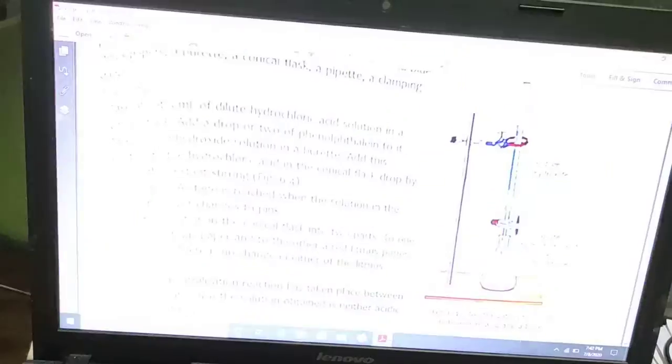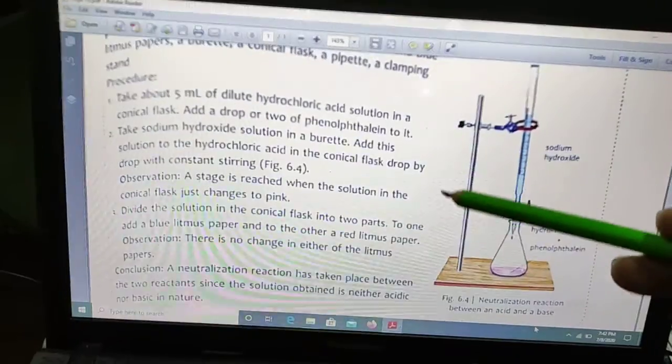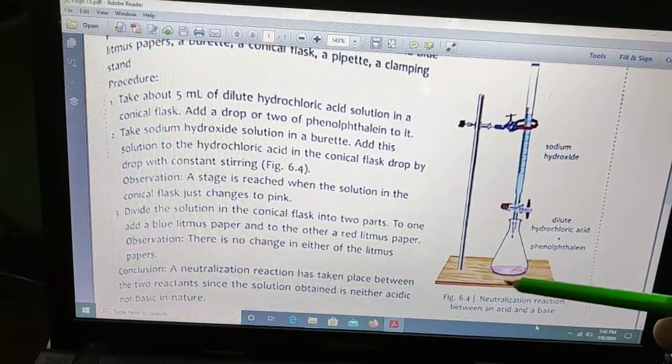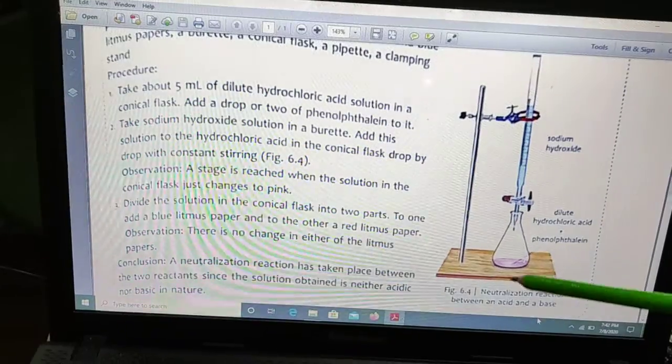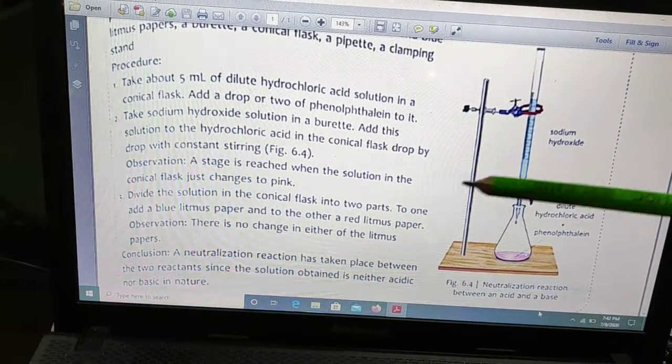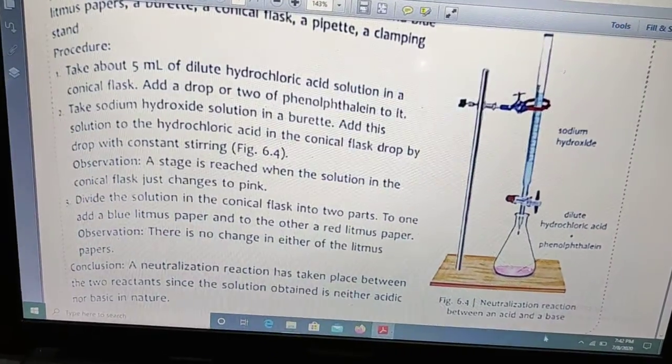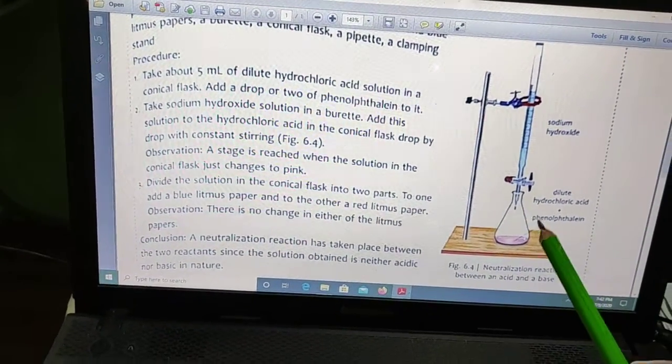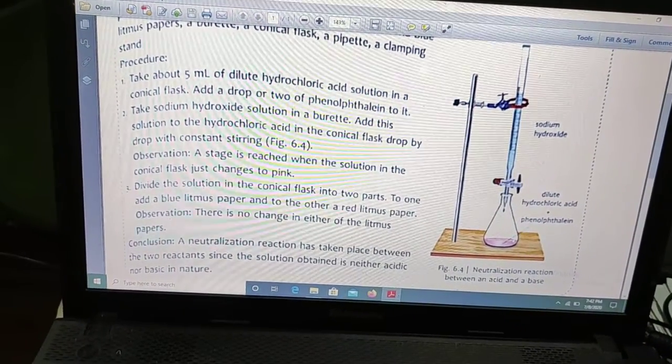That means at that time it has been completely neutralized. This is the procedure as I have explained. In this we have seen that a neutralization reaction has taken place between the two reactants, since the solution obtained is neither acidic or basic in nature. Now when you test that solution which is light pink color, it will be neither acidic nor basic. You can check with the litmus paper.